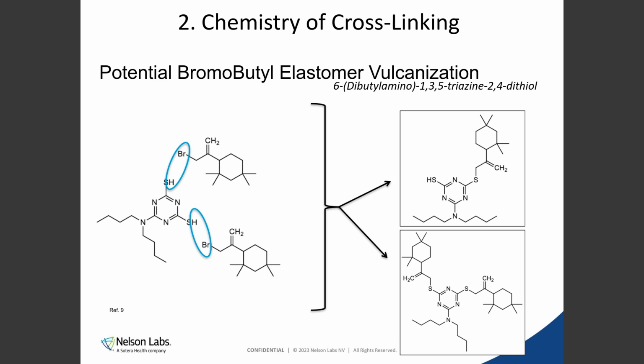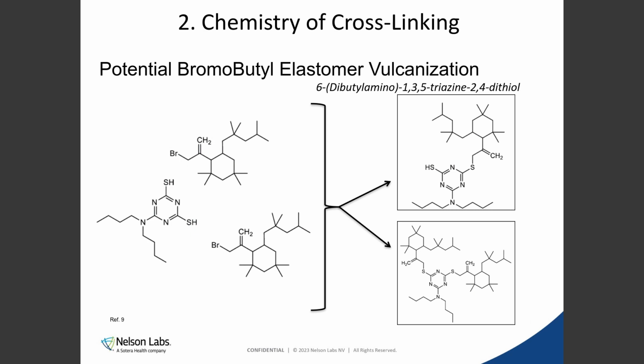What you get are smaller compounds that can be detected with our instruments, potentially at least. And if you look at the C21 compounds, it's essentially the same. They can react the same way, but of course you get other, heavier molecules, but the principle is still the same.